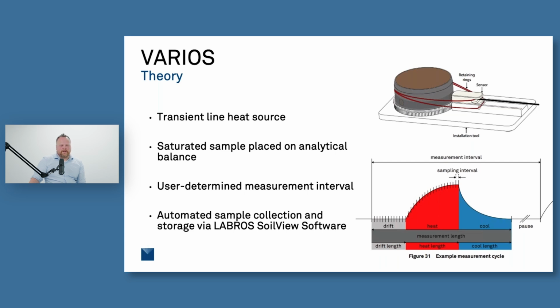So generally our test lengths are going to go from maybe 4 or 5 days up to 10 to 12 days, depending on the soil sample. Particle size and porosity are going to play a big role in that, because it's going to affect that rate of evaporation. So you'll be able to see real-time data in the software as you're doing this, so that you'll be able to determine how long this is going to take.